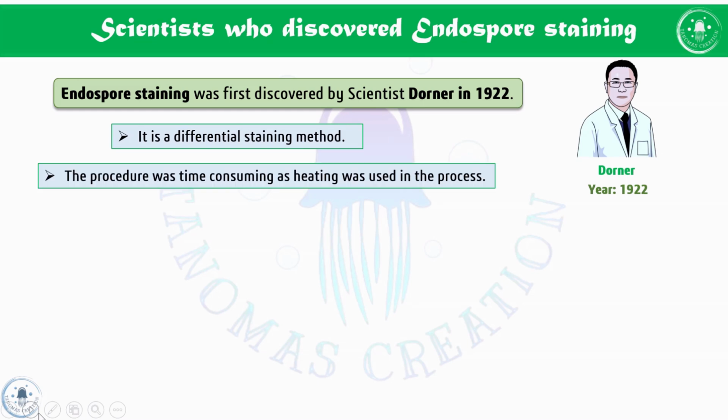The technique proposed by Dorner had a heating process which was very time consuming, and he was unable to give a proper heating method for the endospore.